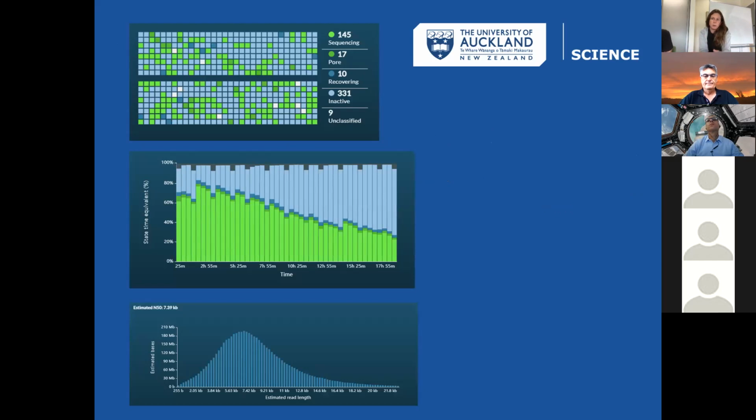And I'm going to talk through how we do these experiments, and because you monitor them in real time, you know how things are working and you know how things are progressing, and you get information back as you're sequencing. And this is all reported on the MinKNOW software, the kind of dashboard that interfaces with the technology. And these are really useful diagnostics, and I just want to take a little bit of time to explain some of the key ones that we use, because I'll use that in subsequent slides to talk about particular experiments.